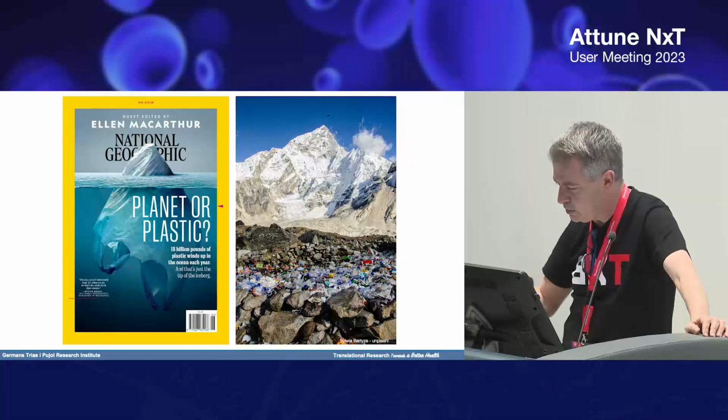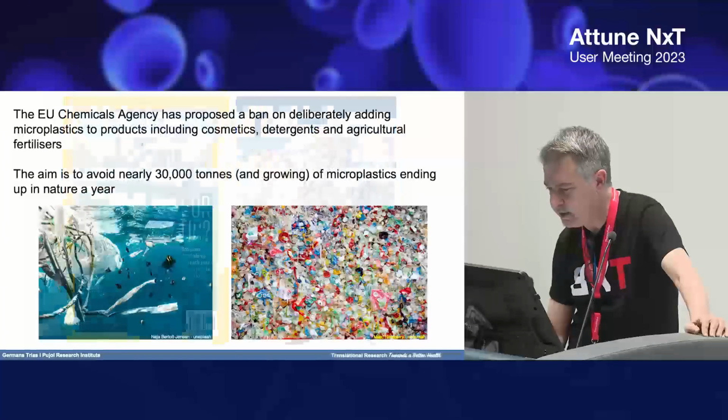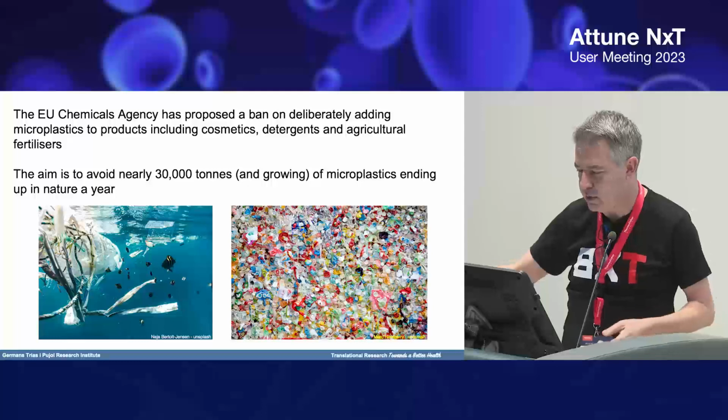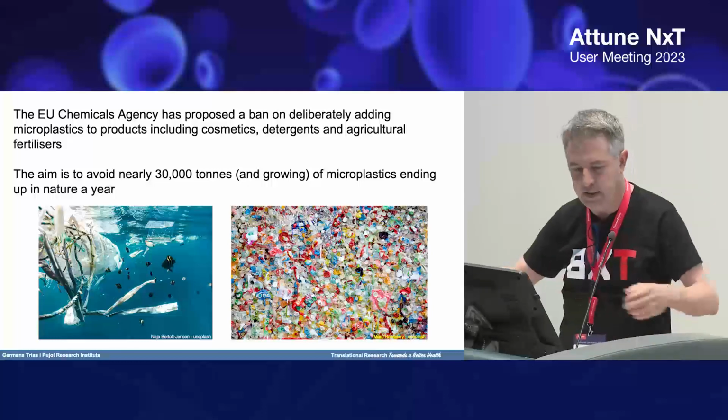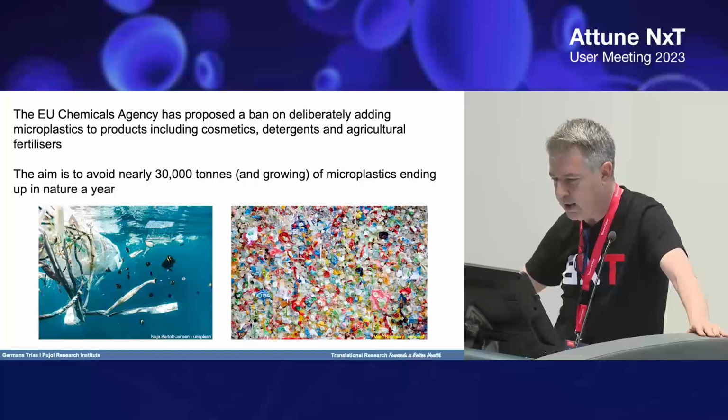And that's the main reason, because we were really interested in looking at the presence of these nanoplastic particles. The classical technology can have several limitations related to the particles that they can measure, but the NxT and nanocytometry can help to detect these very tiny and very small particles.